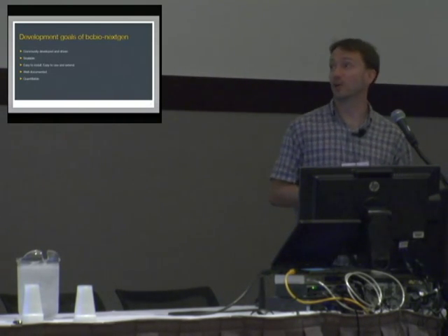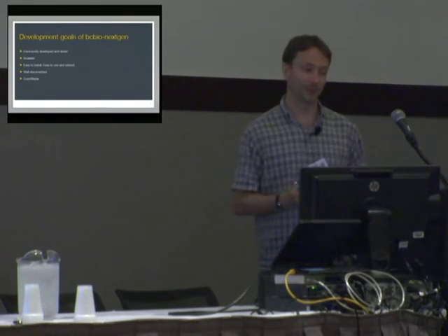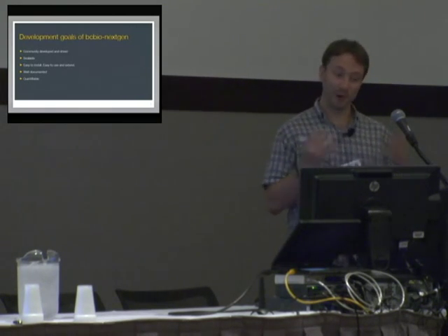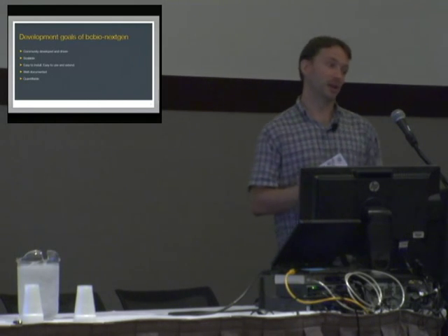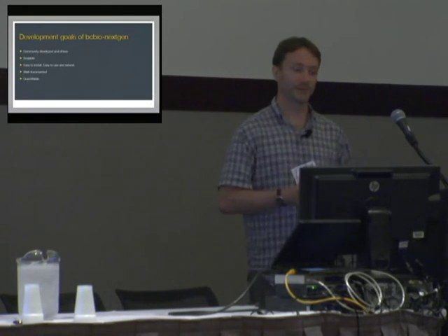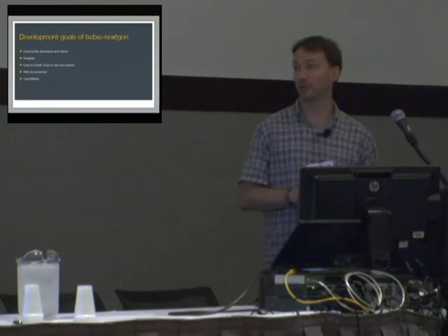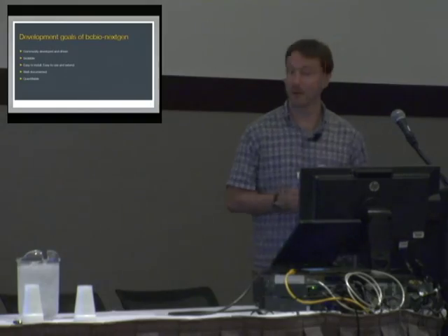The other goal is that the analysis should be scalable and easy to install. So you should be able to start from a bare machine, install everything you need to run an analysis that you can run on your laptop and to run some validation data. And then if you need to scale up to do your whole analysis, it should be just as easy to deploy it on your big compute infrastructure and run the same analysis.